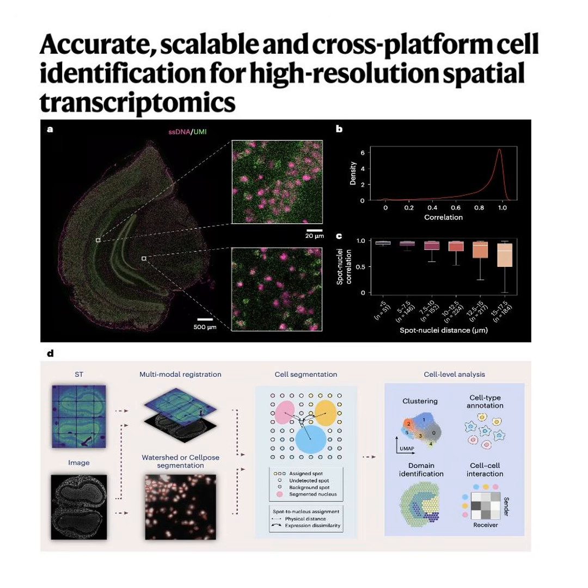Yes. And once everything is perfectly aligned, we hit the real genius of Cellist, probabilistic assignment. Right, because now you have a stray RNA spot just floating out in the diffuse space. The algorithm has to decide which anchored nucleus gets to claim it. Right. And it solves this by minimizing two things simultaneously. First, physical distance. Mathematically, how far is this stray spot from the nucleus? Makes sense. And second, expression dissimilarity. Does the RNA profile of this random stray spot biologically match the RNA profile of the nucleus? Which is based on this huge finding in the paper that nuclear expression and cytoplasmic expression are highly correlated.